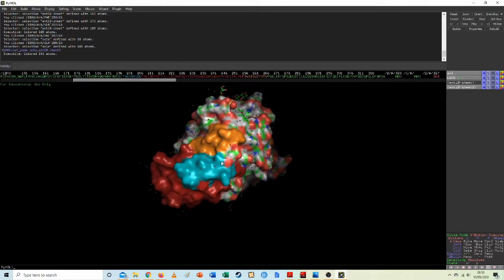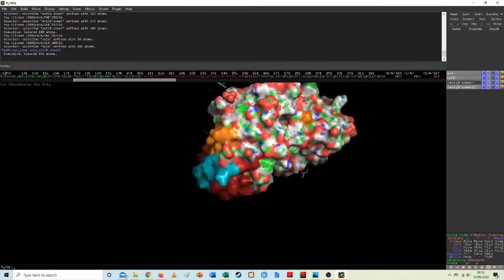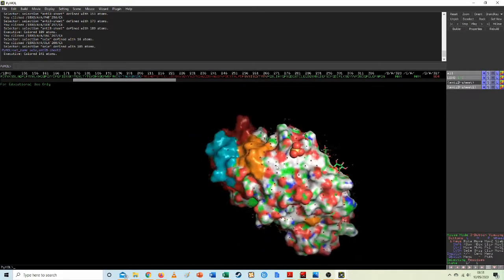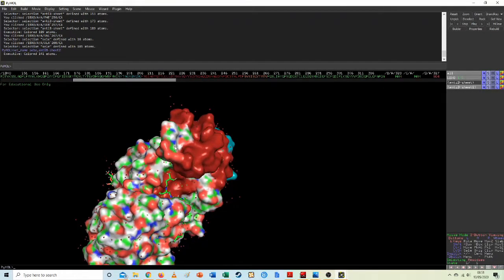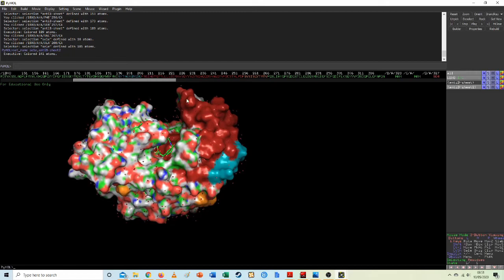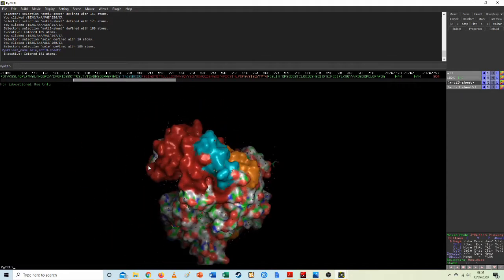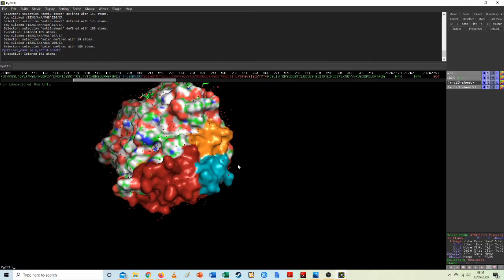Right, so over the whole surface, we've got those reds, as you remember, were alpha helixes, and that's all undulating, and we've got this big cavern here, whereas our beta pleated sheet on the surface, and this is all one beta pleated sheet, but this section is contiguous with itself and this section is contiguous with itself.